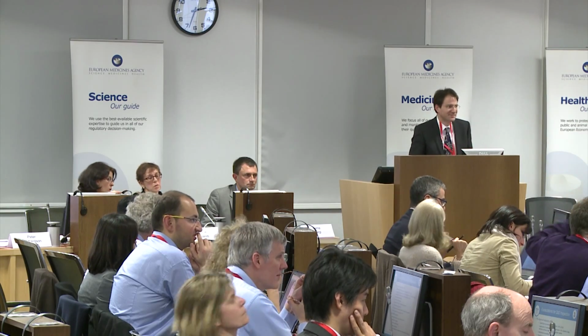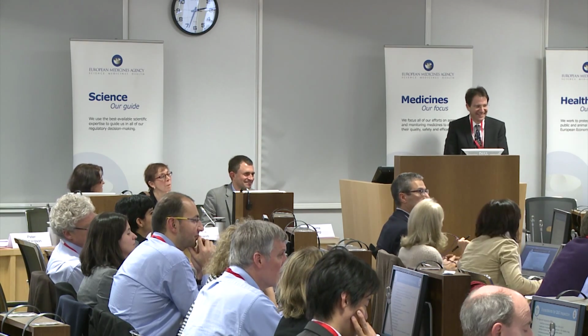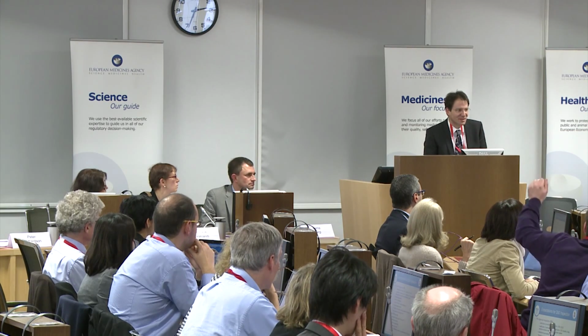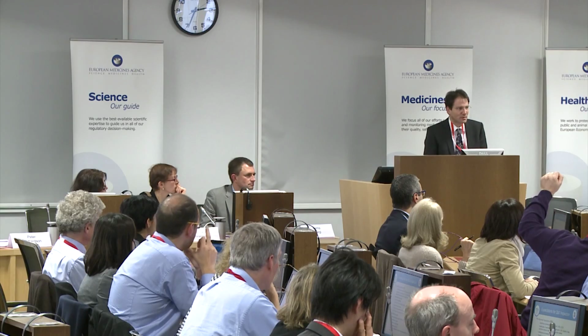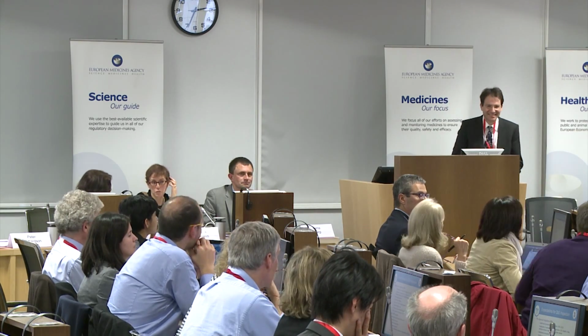Yeah, Dora, please. Lorenz, with the danger of eating on my time, I'm just going to ask a question. When you do the content, are you using a tandem system, or are you taking the tablets and you go to the lab and you analyze them? At the time where we introduced the technology, the tandem was actually not in a mature state to use it. So for subsequent projects, we will use an online handling of tablets, but for this, the tablets were transferred manually to the probe. Okay, good. Thanks. Last question.